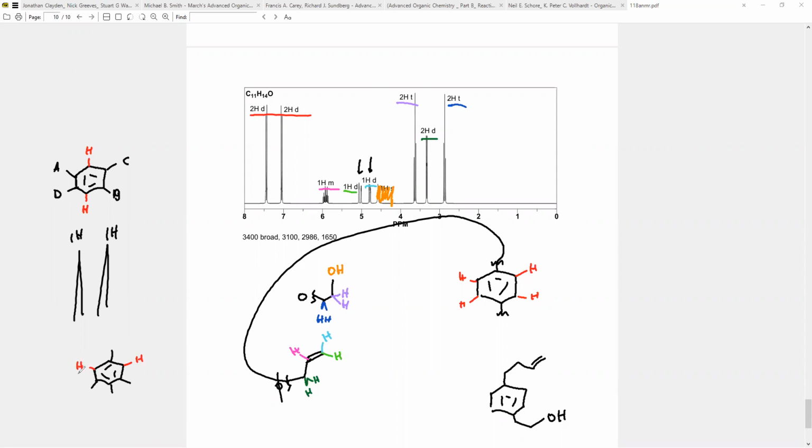Oh, yuck, that is especially disgusting. If I, let me put the A, B, C, and D. That way I don't make any stupid mistakes again. A, B, C, and D, right? Okay, clearly no symmetry, but these will also just be singlets. Oh, I guess the 2H is a little bit harder because this will also be two singlets. Whatever. Anyways, you'll probably never see those guys, luckily for us. But again, if I were to try to rationalize my 3H structures, how would we do that? If I want to rationalize my 2H structures or my 4H structures, how would we do that? Things to think about. Okay, cool.